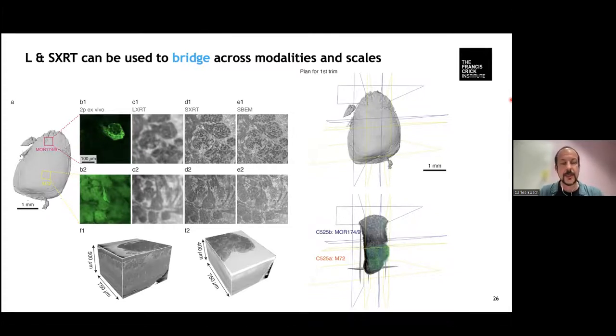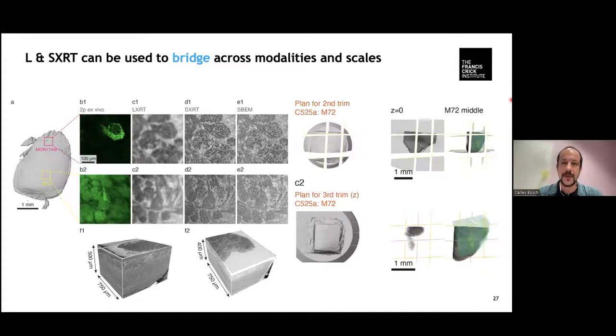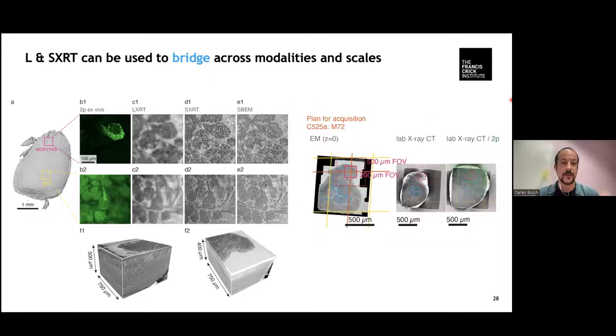So we have two genetically identified glomeruli in this tissue that we want to obtain an electron microscopy data set on. So here, X-ray microscopy allowed us, over several iterations, to run through the trimming of that data set to consistently verify that the region of interest was still in sight until we made it small enough it could enter the electron microscope. And even then, it helped us determine the exact location of the field of view that we should target with a serial block face, which only gives us an insight of the surface of the tissue, so it would effectively contain the full glomerular column in both cases.